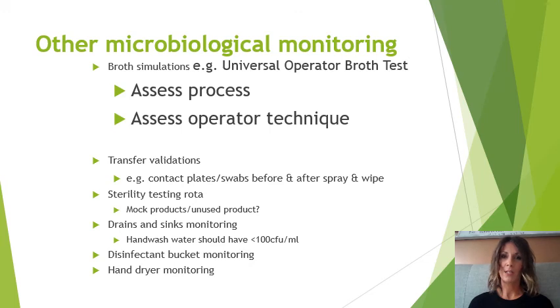The problem with sending saline for sterility testing is the nature of saline: it could actually inhibit any organisms that have been introduced. Is it representative of a true sample? It's questionable depending on what your diluent is. It doesn't represent any of those that are made in glucose.